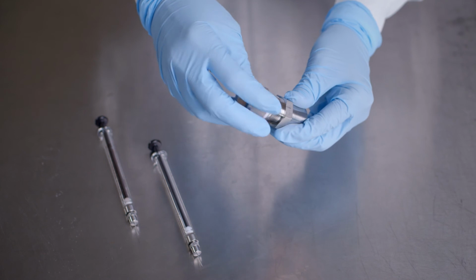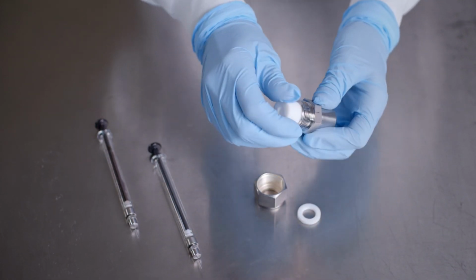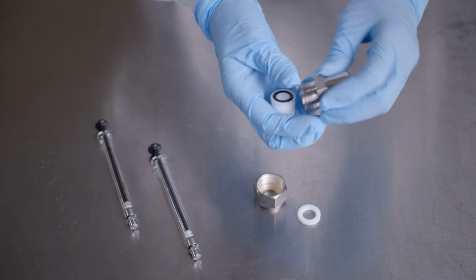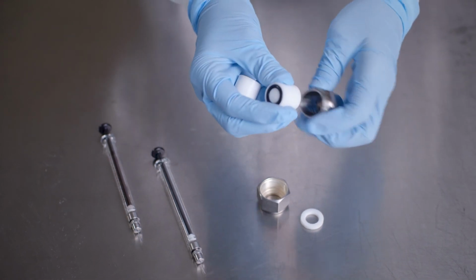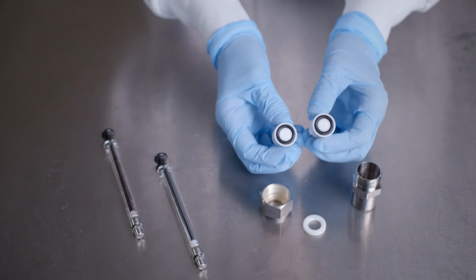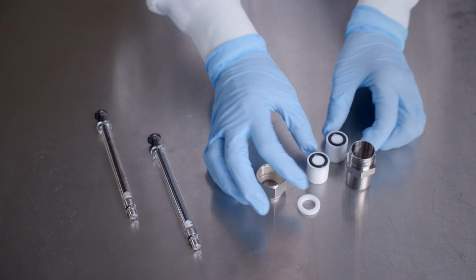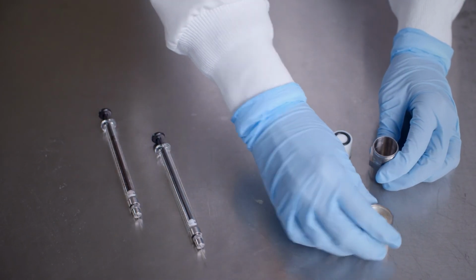And now for a few tips on the care and cleaning of your mini extruder and syringes. Immediately after use, disassemble the mini extruder and syringes. Remember, the polycarbonate membranes and filter supports are intended for a single-use liposome preparation and can be discarded. Next, we will thoroughly clean our mini extruder parts using a mild detergent solution and allow it to dry completely prior to reuse with a new lipid preparation.